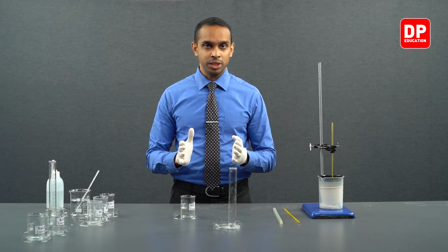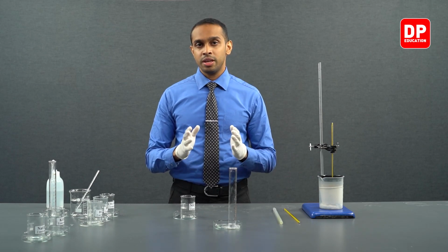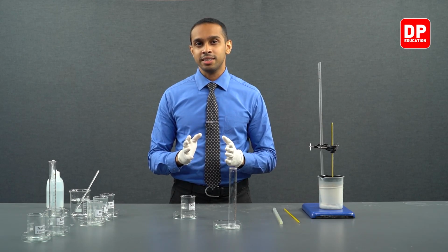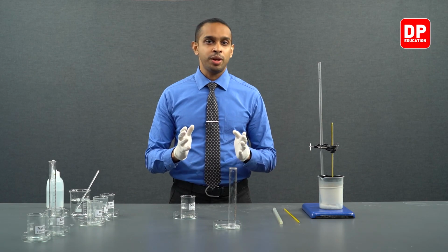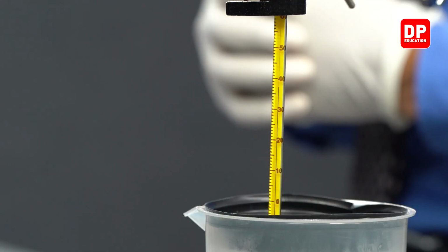The initial temperature of the acid was 26 degrees Celsius. The initial temperature of the base was 24 degrees Celsius, and the highest temperature that the reaction mixture reached was 37.5 degrees Celsius.